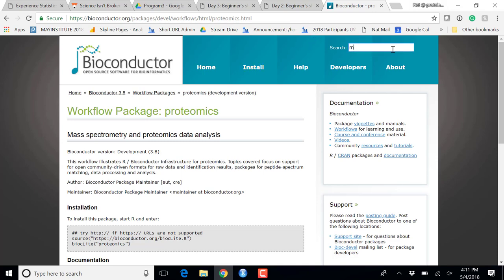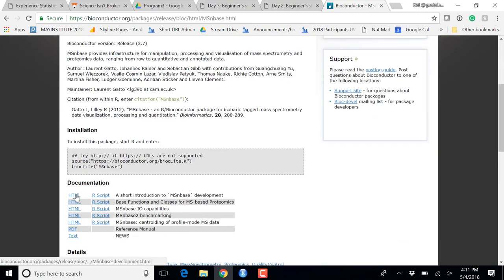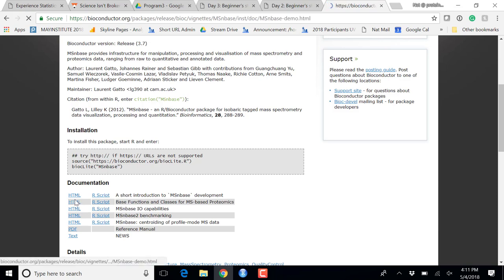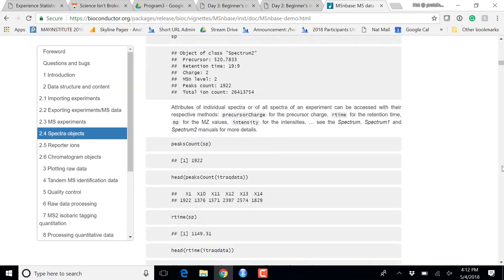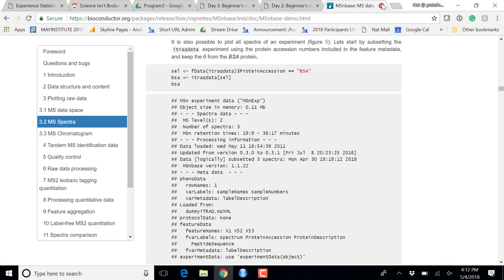Something else that is useful is if there is a package of interest. Every Bioconductor package comes with what are called vignettes. So, for example, the Msnbase package that I want to show later comes with this relatively long documentation about the package that provides a general overview. So not the documentation about the functions that I showed yesterday or the day before, which is very technical, and you need to know what you're looking for. But these are a large overview of what can be done with the package. And maybe the last thing that you could do is to ask a question on the Bioconductor support forum. I'm trying to do this analysis. Does anyone know a package that could do it?